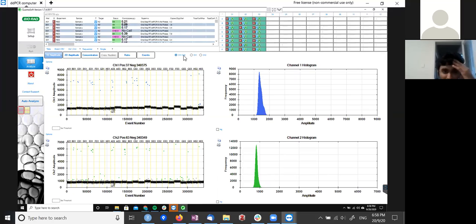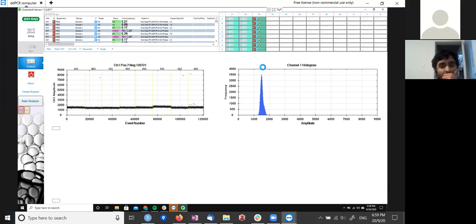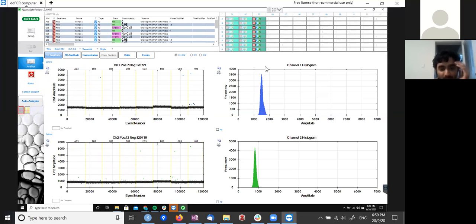What samples are these again? I don't know what samples they are. I think they came Thursday? Okay, so these are the manhole samples then. Yeah. They collect some extra samples and bring them to us sometime in the week.